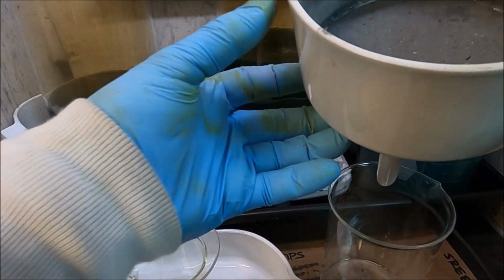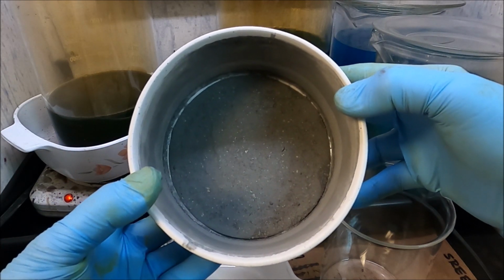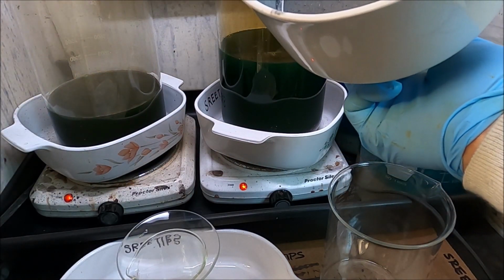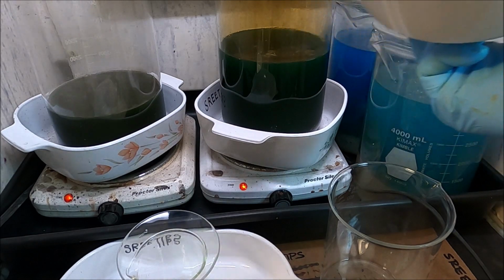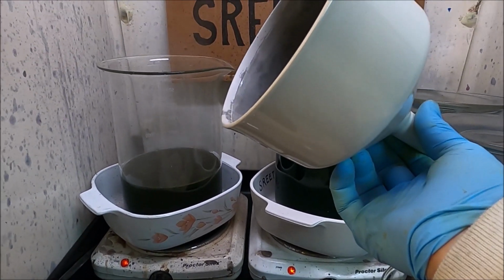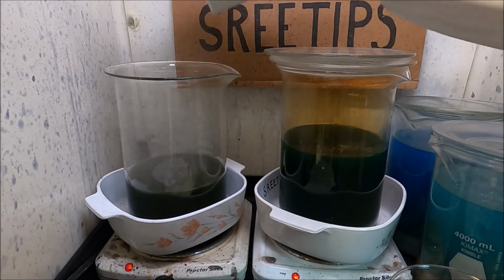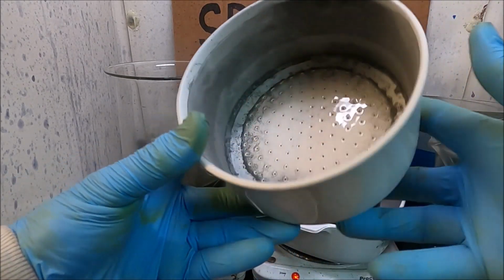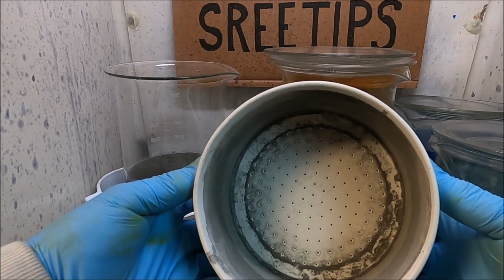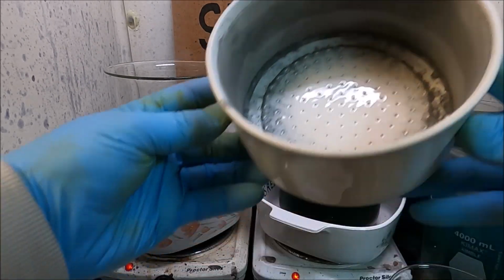This is our filter from the part 1 of the video. It's got some solids in it. I'm just going to add that right into this beaker with the finely divided solids. The paper will disintegrate, and all the solids should follow the rest of the solids in here and go into solution. So I'm just going to add that filtered paper right in. All of this residual material in the funnel, I'll wipe this out with a paper towel or filter paper and add it to my paper storage.